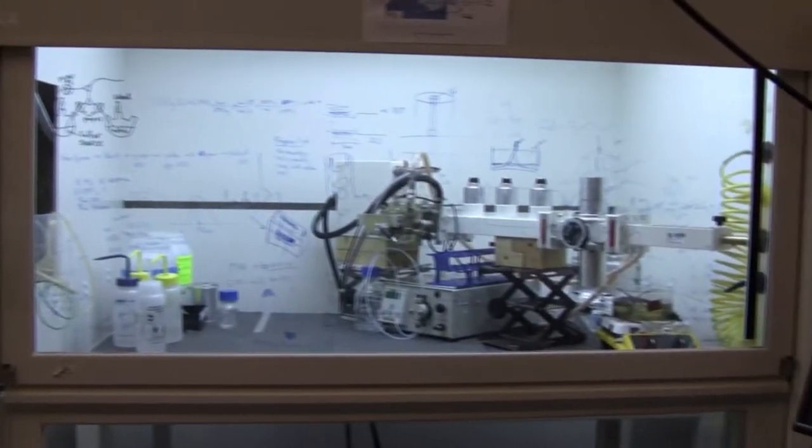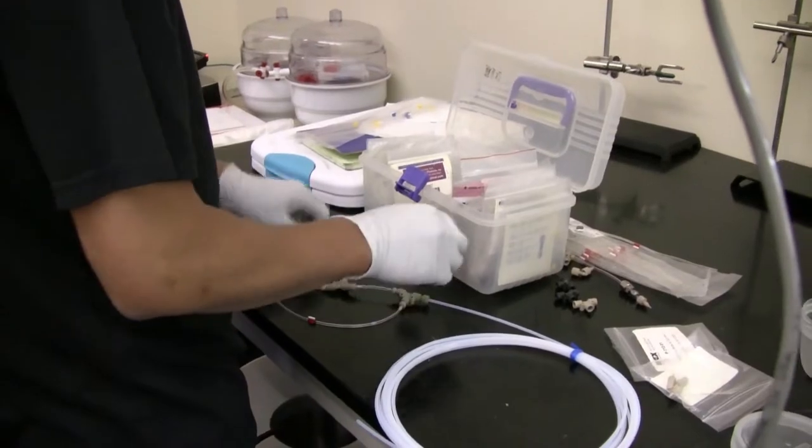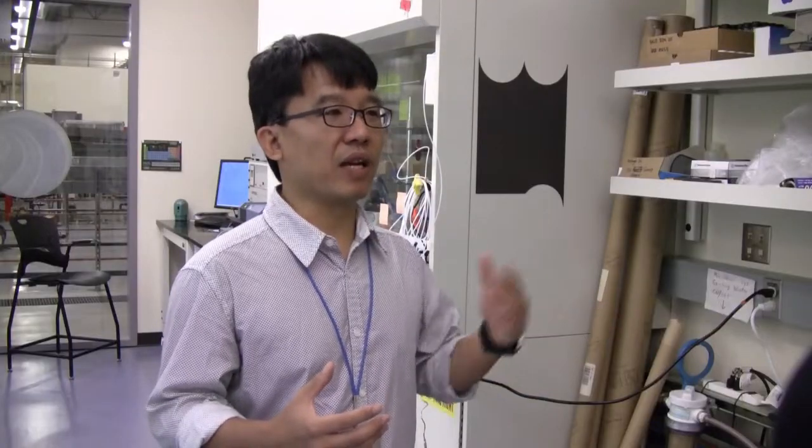The way we work with industry, there are several levels. If you need to use a piece of equipment that our lab can offer, you can just come in. Either our staff can help you do it, or you get the training and then you can come in and use the facility with a fee.